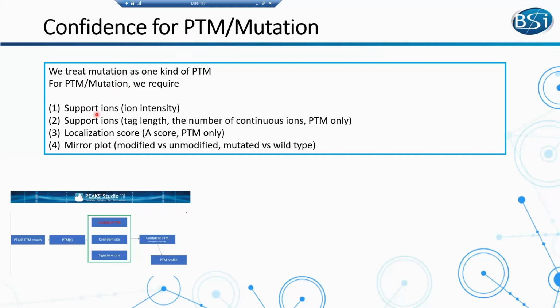For supported ions, it's the same. If we say this PTM or this mutation is confident, we should have the ion intensity filter. Make sure this peak, which we believe is a real peak, is not noisy.